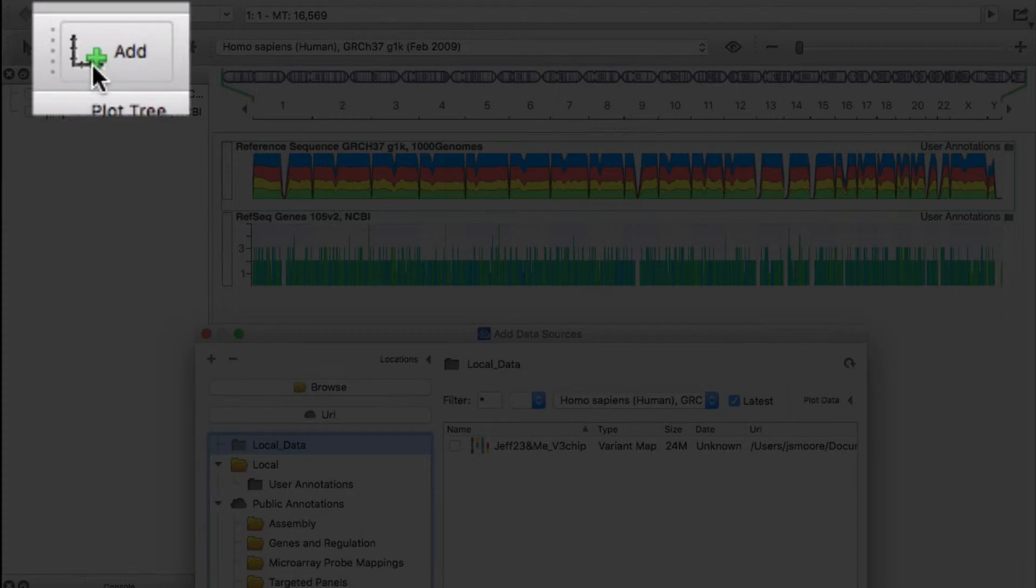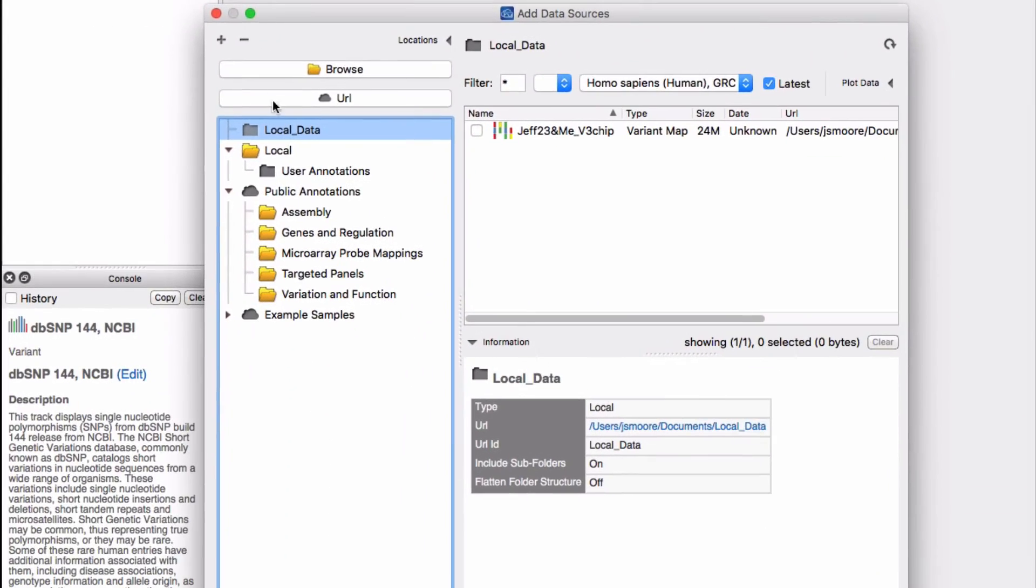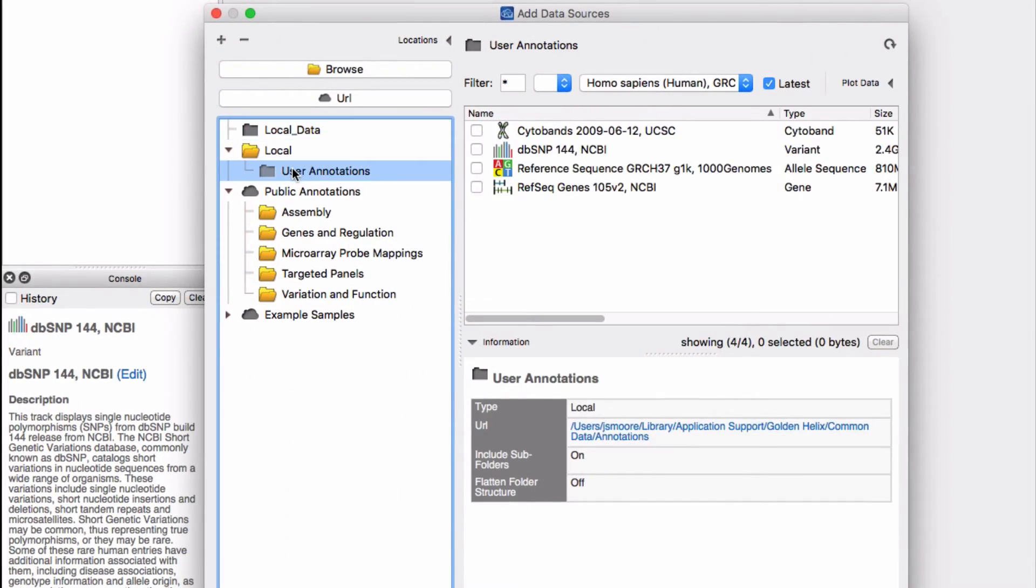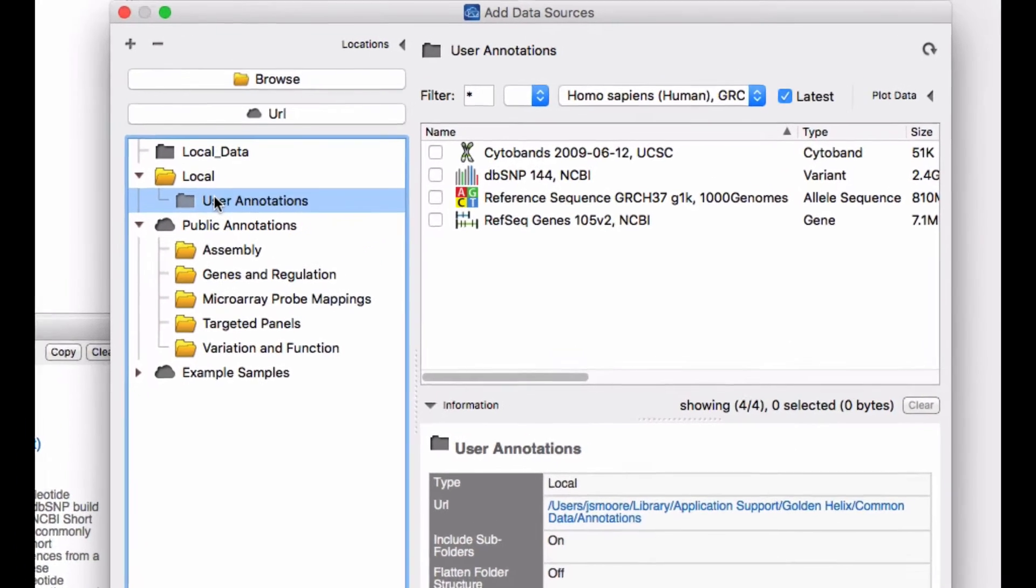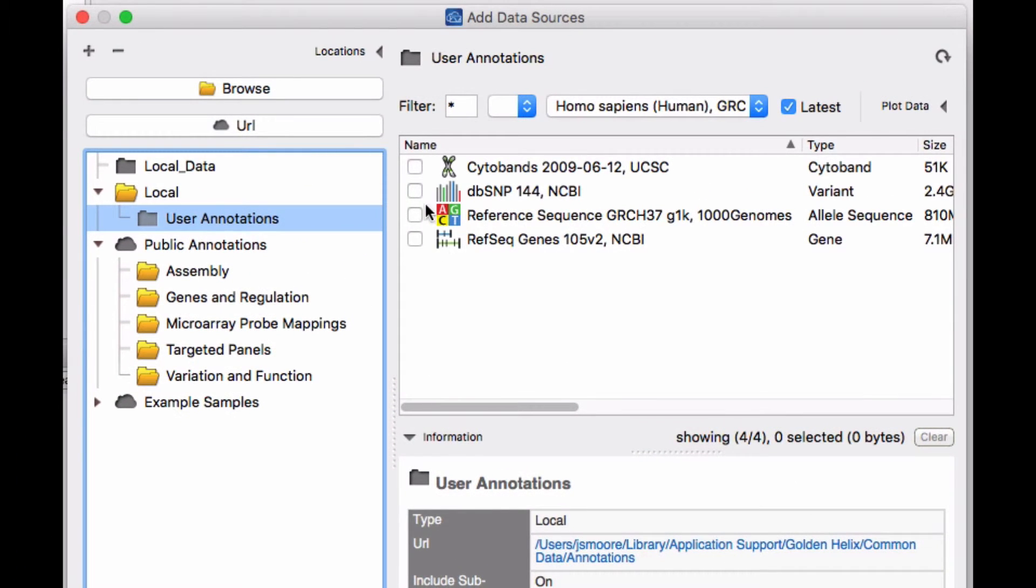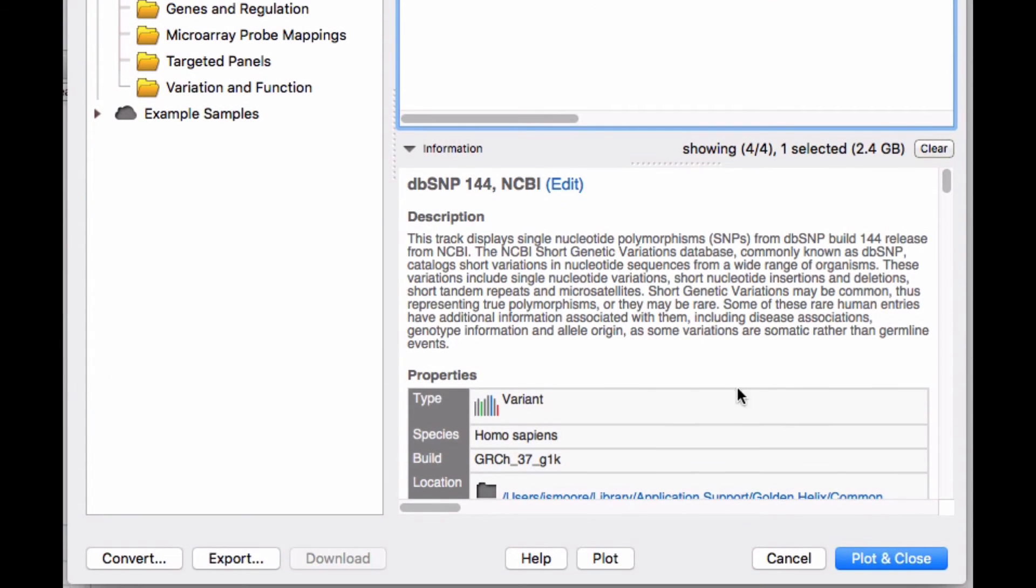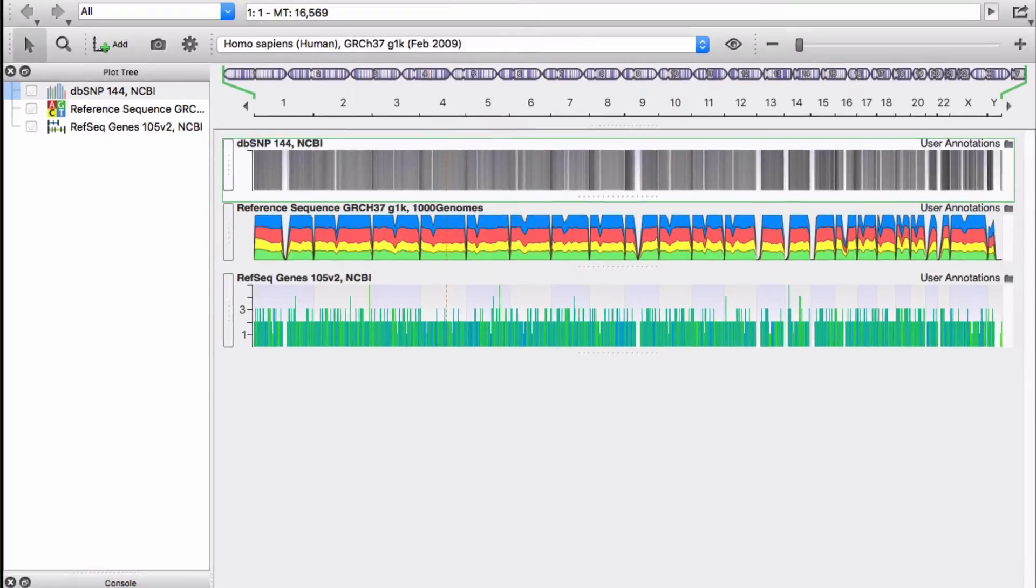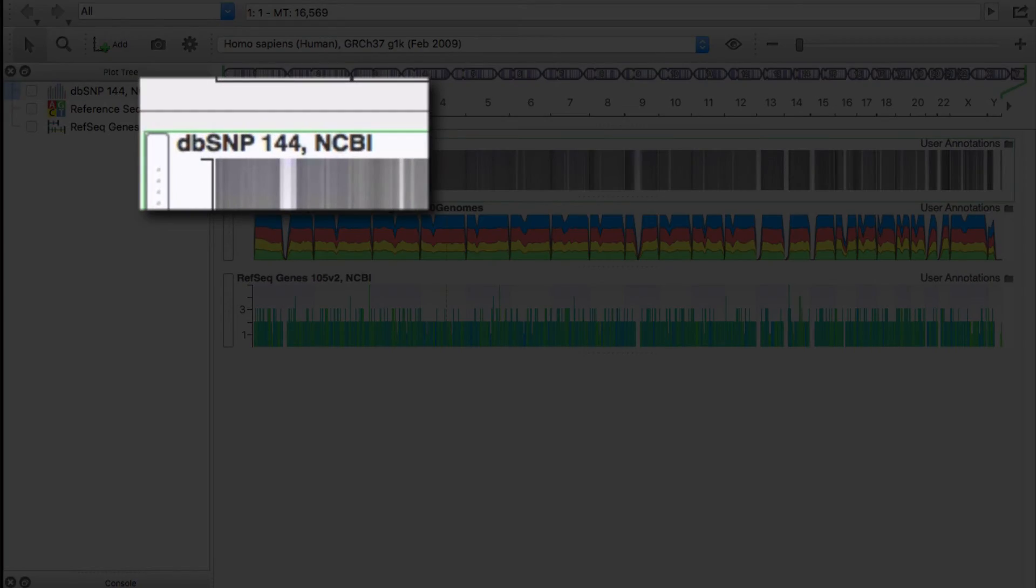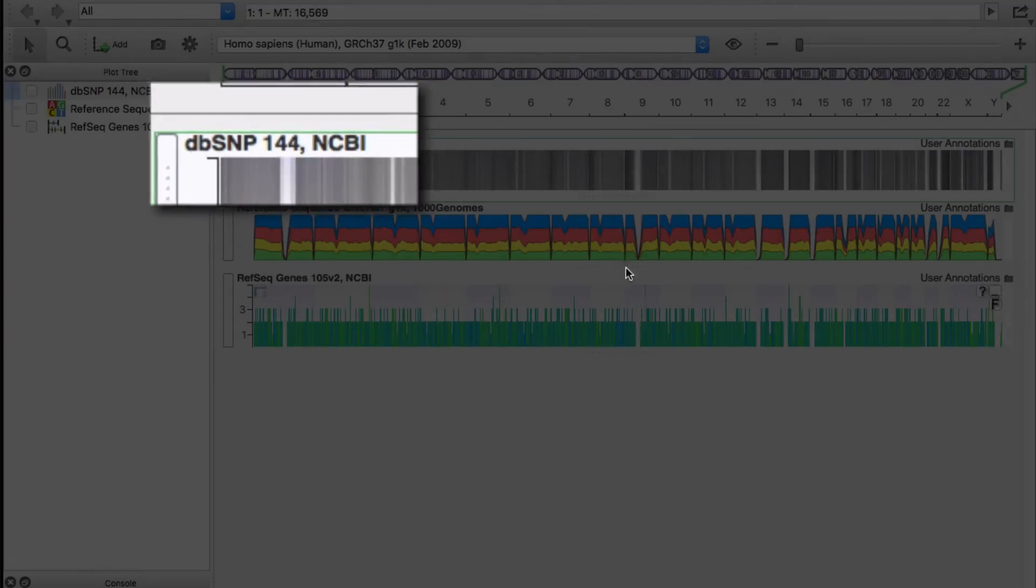When the download is complete, you can locate your local copy of DBSNP 144 in the user annotations folder. Click the box next to the file then click plot and close. A DBSNP track is now displayed.